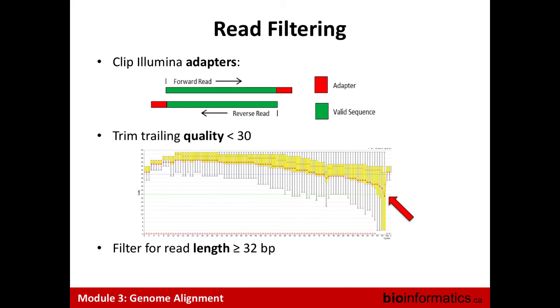So you will have some fragments from the tail, and if the tail is too large, it could really reduce the size of the fragments you are catching. So if your fragment is shorter than the read length you will generate, you will read your read, and at the end, when your fragment is finished, you will continue to sequence, but you will sequence the adapters. That's how we get this data in your FASTQ file.